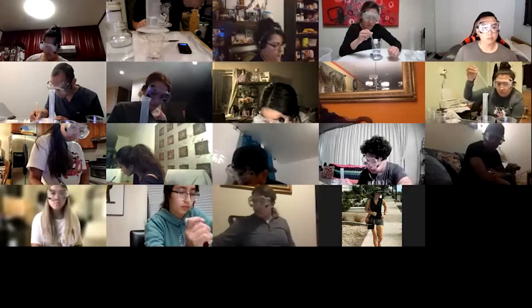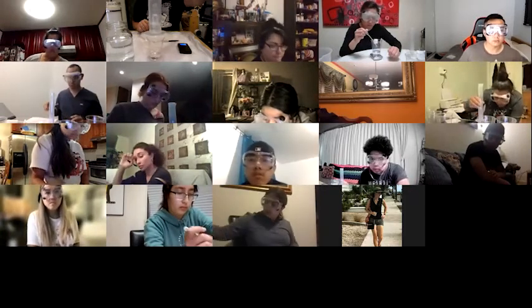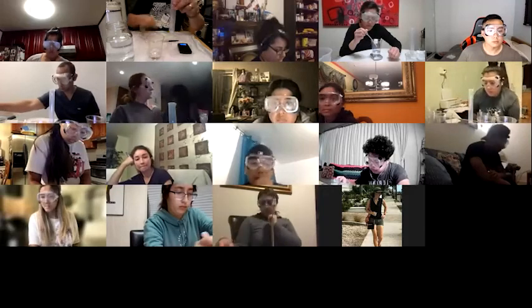Then I don't dump this out. I just add another 5 mL to it till I get to 10, doing it the same way.